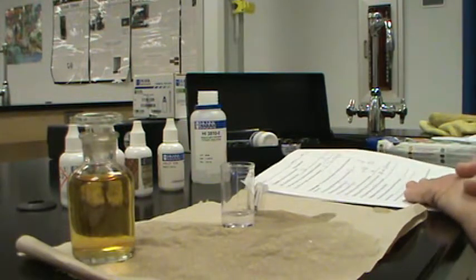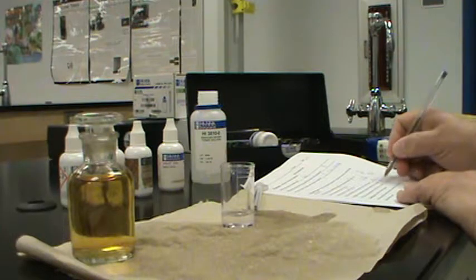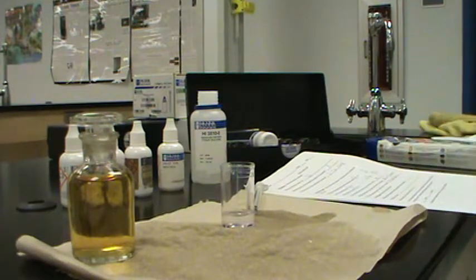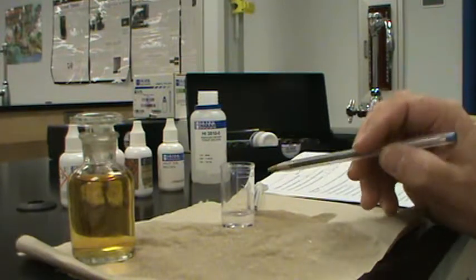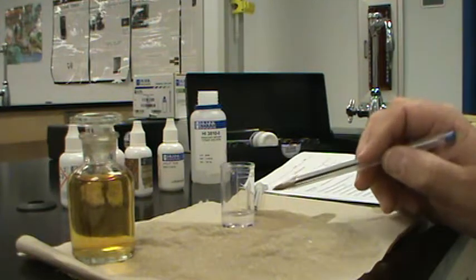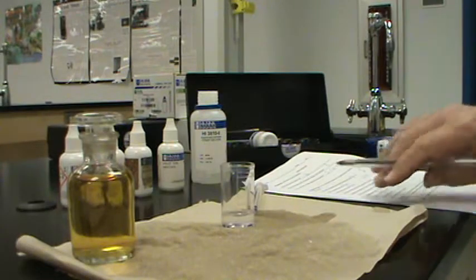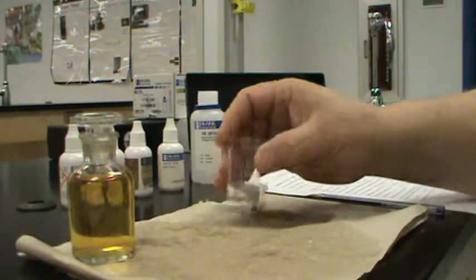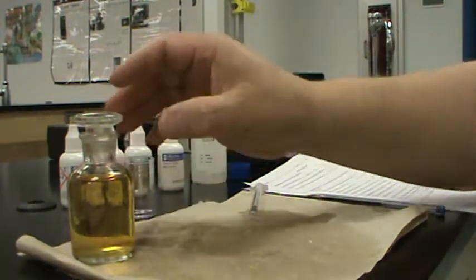And according to our scale, 0 to 5 is low. Anything over 5 is high. What is our sample? Our sample is 4.8. It is near high. And as a matter of fact, most fish would be able to survive in this. And considering that this water is coming from underground, its dissolved oxygen content is very high for us. So we could actually round it up and say 5, but we're going to call it 4.8. We're going to be precise because we want to be precise.